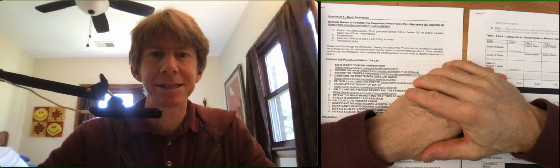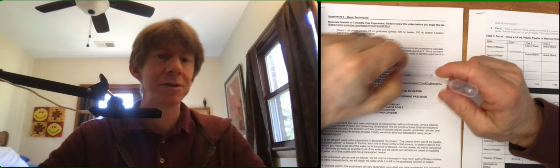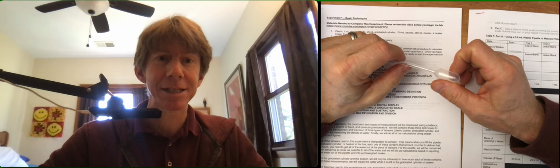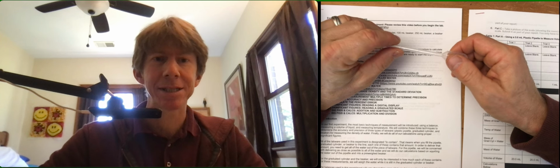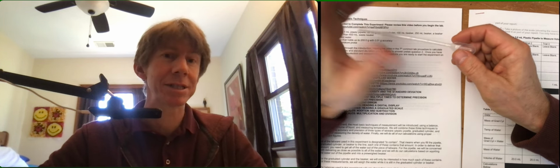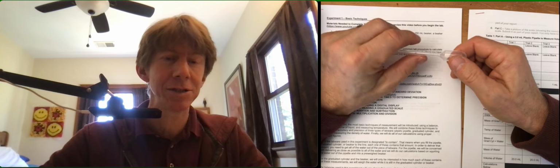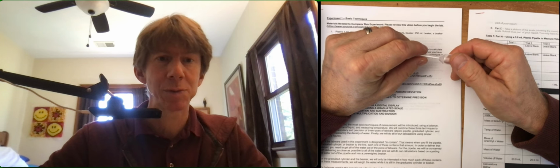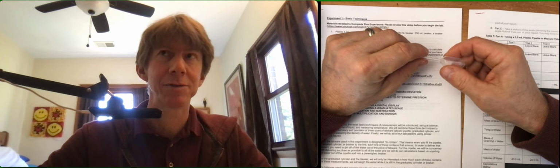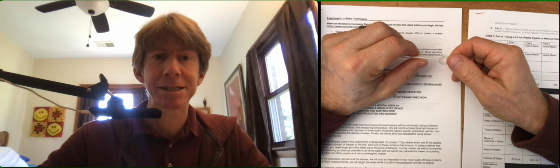So Basic Techniques is a lab in which we look at 3 different pieces of glassware, or plasticware in this case, and we evaluate their accuracy and precision. It all says this in gory detail in the introduction to this lab. Accuracy is how close a measured value or an average value of several measurements is to the correct or accepted value. And for accuracy, the calculation that you need to do is percent error. Precision is the reproducibility or repeatability of the same measurement done 3 or more times, and the calculation for that is the standard deviation.